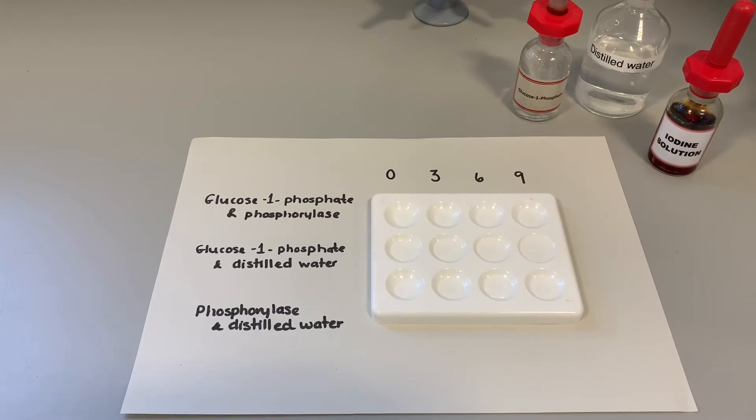And the last one is also a control. This time the enzyme phosphorylase is in with distilled water. Again, two substances to make sure that the volume is the same. And what that row is going to do is hopefully prove that phosphorylase does not turn into starch by itself. The only combination that will produce starch is glucose 1-phosphate and phosphorylase.